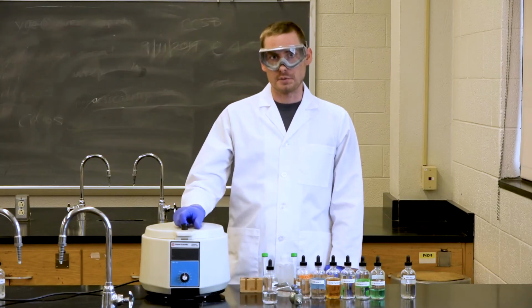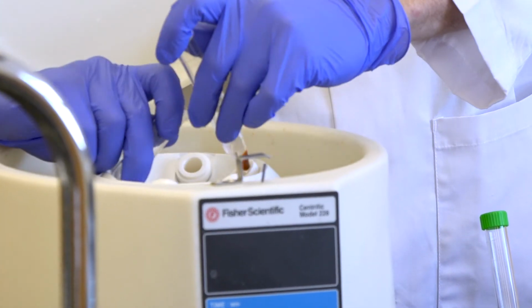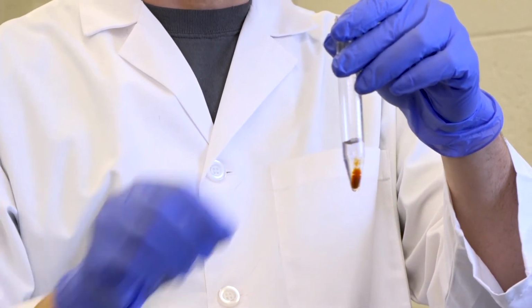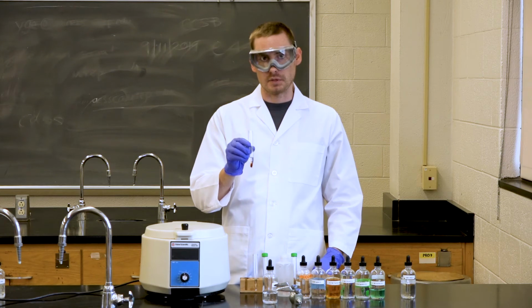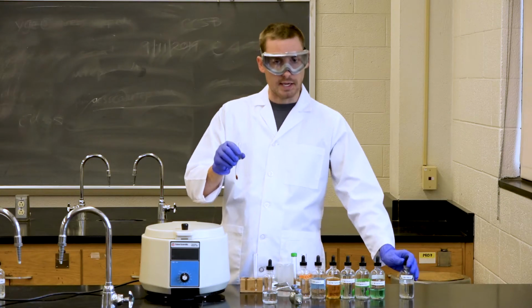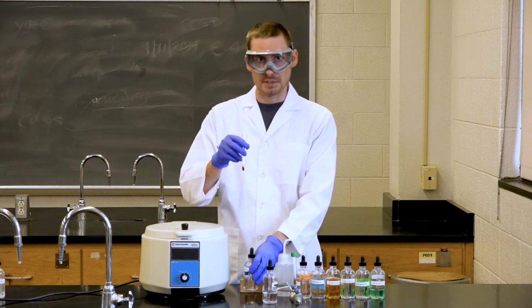So after centrifuging, we can now remove our test tubes. We're going to need to separate the liquid from the solid. Again, very carefully pour the liquid of this part into a new test tube. Take the test tube that has the red solid in it and add about 5 drops of nitric acid until the red precipitate has dissolved.